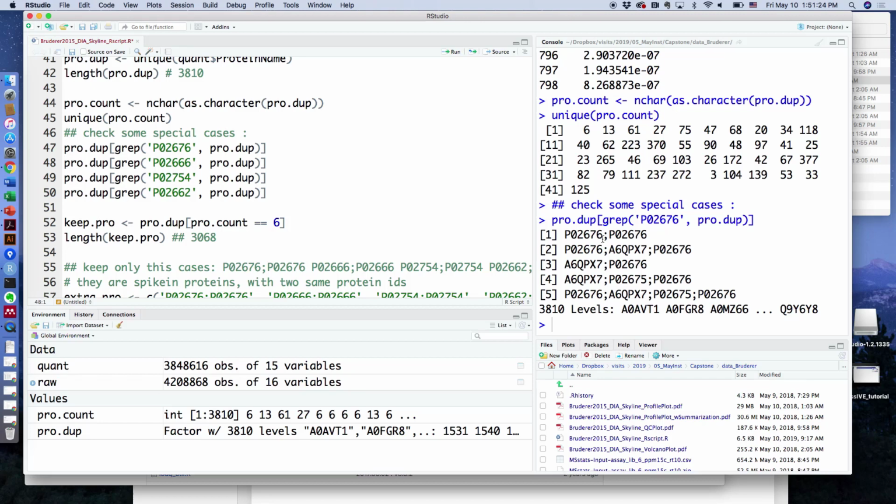For this one, it seems that specific peptide is shared between these two, so I don't want to quantify it. But this one just repeats twice, so I changed the name to include only one. That's some extra steps I performed.